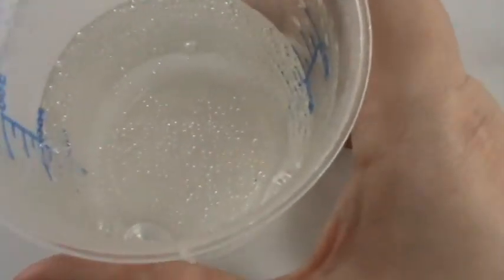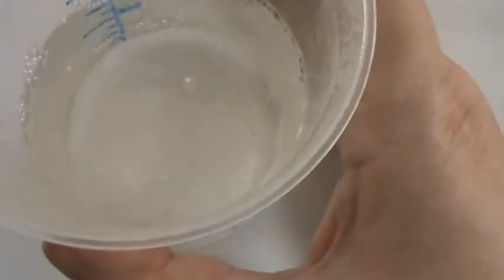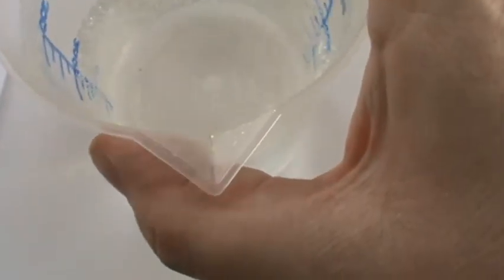And now you can see more bubbles that have formed. And I want them all to escape. Okay, that is pretty good.